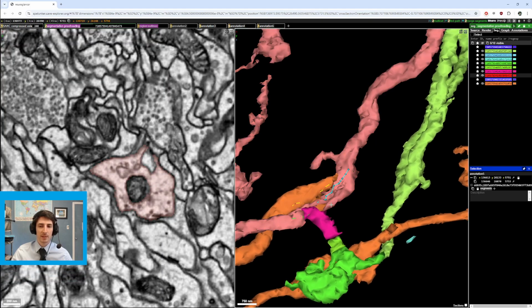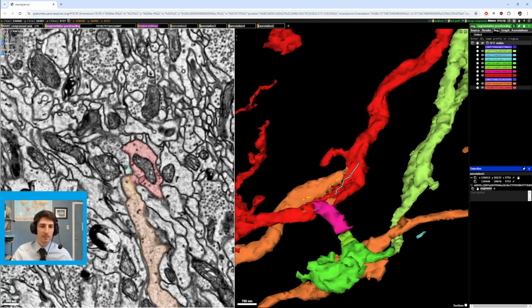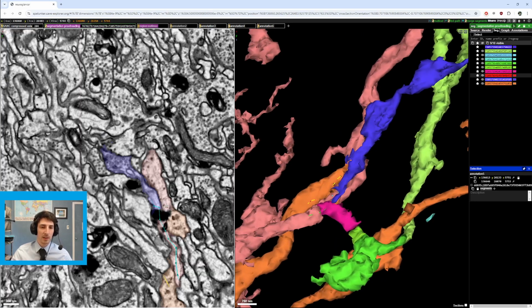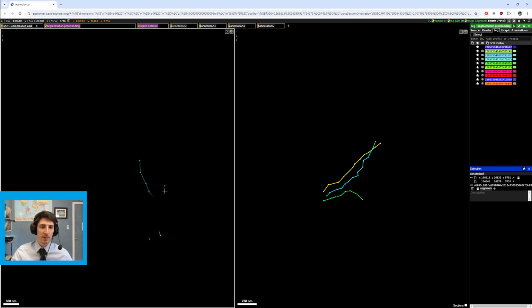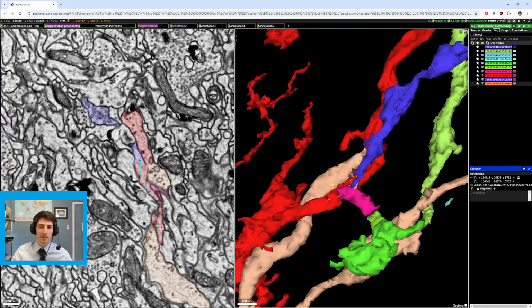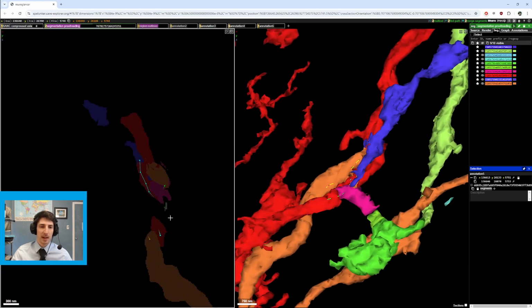Now that we know that, we can keep on scrolling. And now let's see where this path goes. So one thing you're going to want to do, as you can see, the red path that we just connected to the orange path is merged with this purple path.